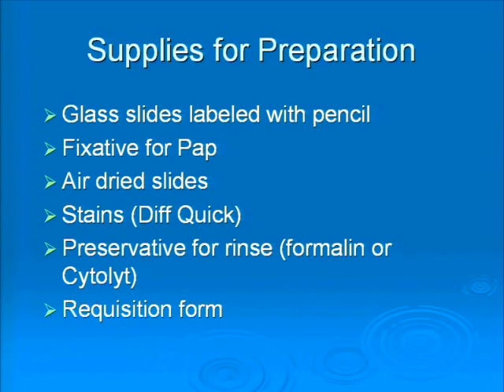We'll talk about doing pap-fixed slides, which are the alcohol-fixed ones, and we're going to talk about doing air-dried slides, which are the ones that are done with the Diff-Quik or the rapid stain. That's the stain that we're actually going to practice next door, because the Diff-Quik only takes about a minute and a half to do. Your pap stain, while there are ultra-fast pap stains out there, most places do not use them. So that stain takes about a good hour and a half, so it's not something that you'll typically participate in.